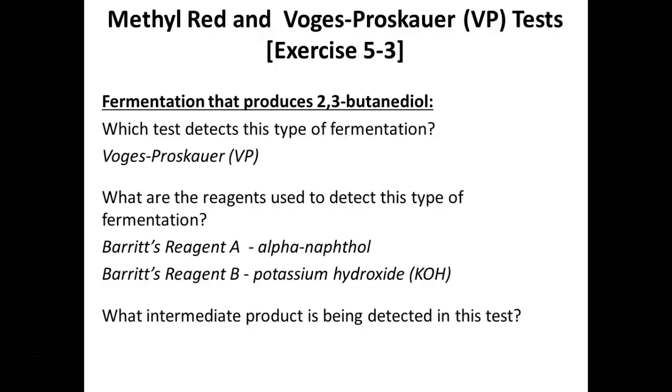What intermediate product is being detected in this test? We don't detect for the presence of 2,3-butanediol, do we? We detect for its intermediate, which is what? Acetoin. Not to be confused with acetone. Different molecules. Acetoin.